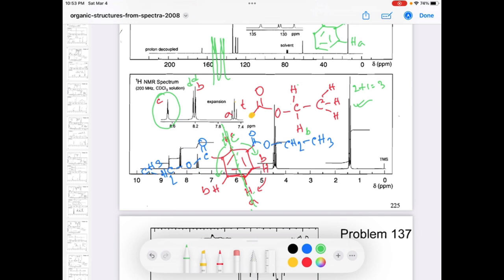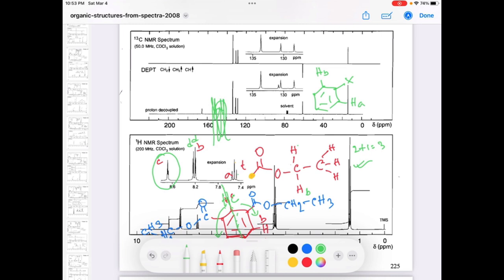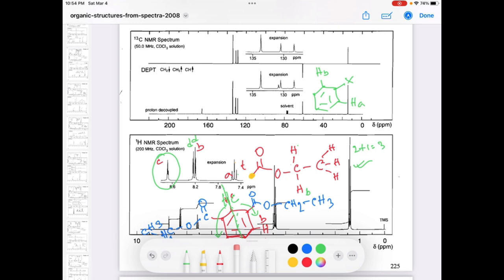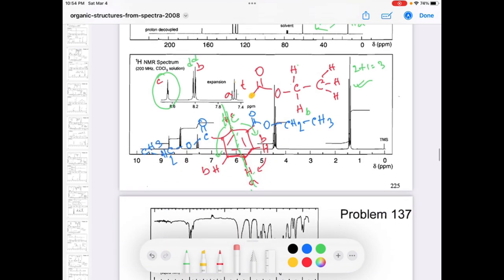So now from the carbon NMR also, if you look at the carbon NMR, from our projected structure, how many carbon signals should we see in this NMR? Since it is a symmetric molecule, just assume one half of the structure. So here you will see one carbon here, another carbon here, another carbon here, and another carbon here, total 4 carbons, because the other half is also the same.